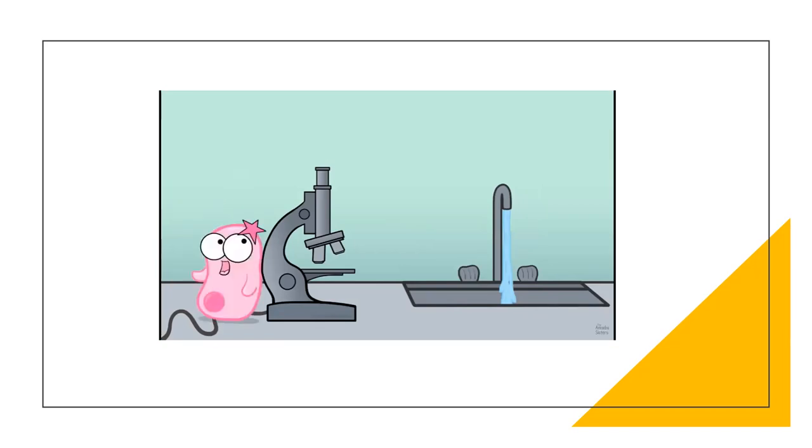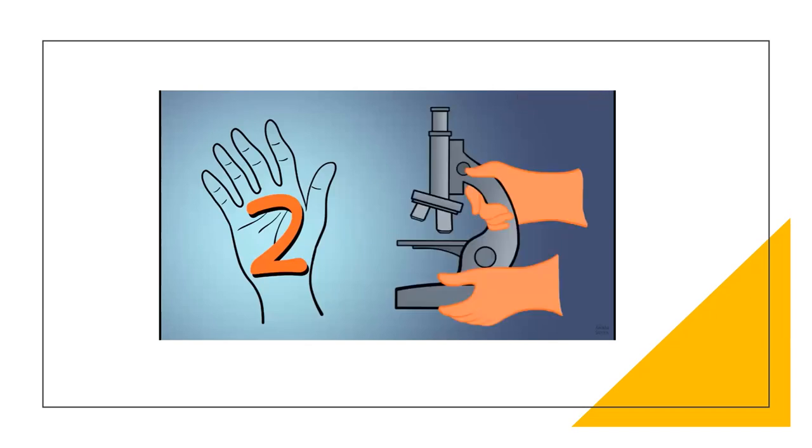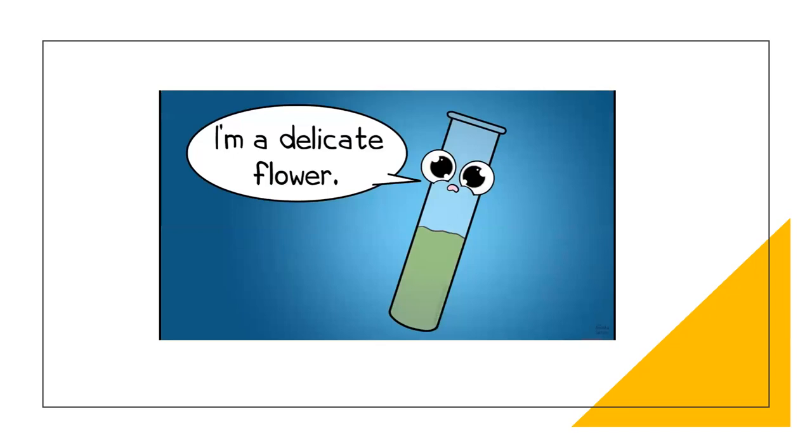And speaking of microscopes, we could have an entire video on just working with the microscope. But for now, we'll make sure to mention carrying it with two hands, one hand underneath the base and the other holding the microscope arm. If you're using any special science equipment, it's important to know how to carefully carry it.